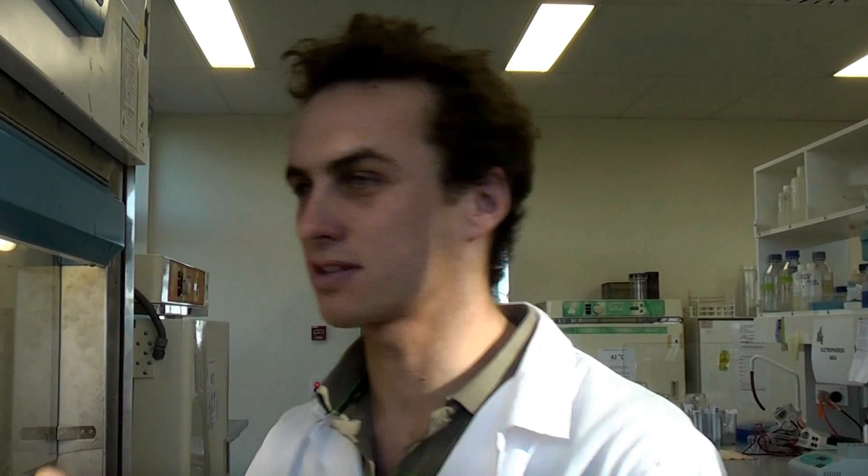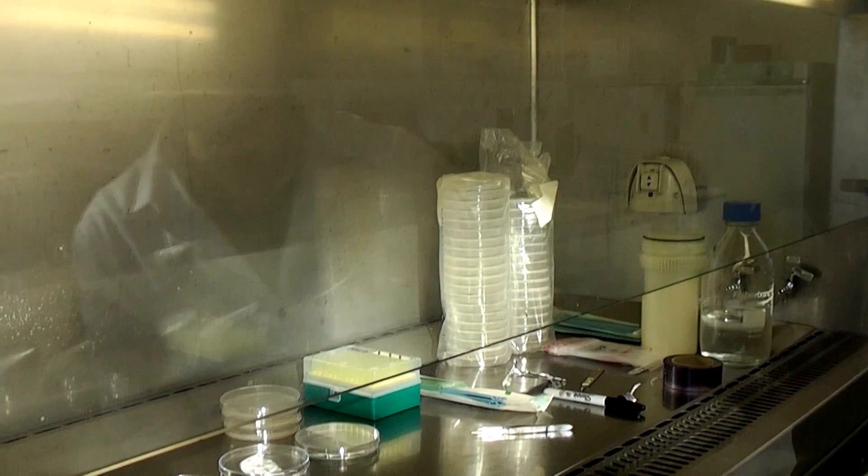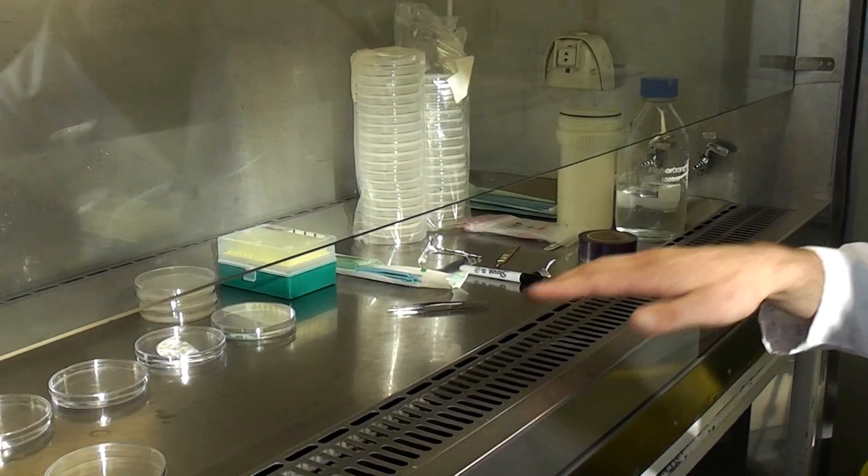This is a laminar flow cabinet. What I've done until now is I've just turned it off. It's been under ultraviolet light for 15 minutes and sterilized with ethanol, so that makes sure there's no bugs in the cabinet itself, which makes it 100% sterile in there. Any work you do with bacteria you need to be working in a cabinet like this.